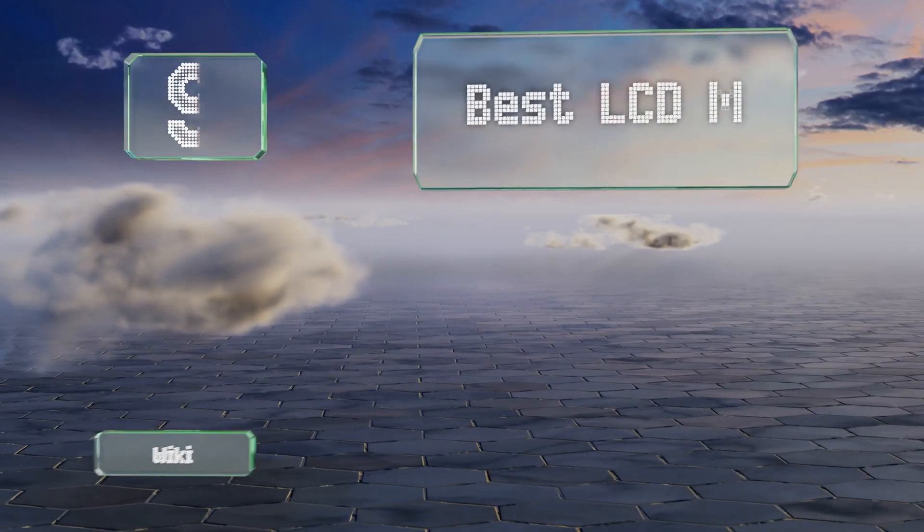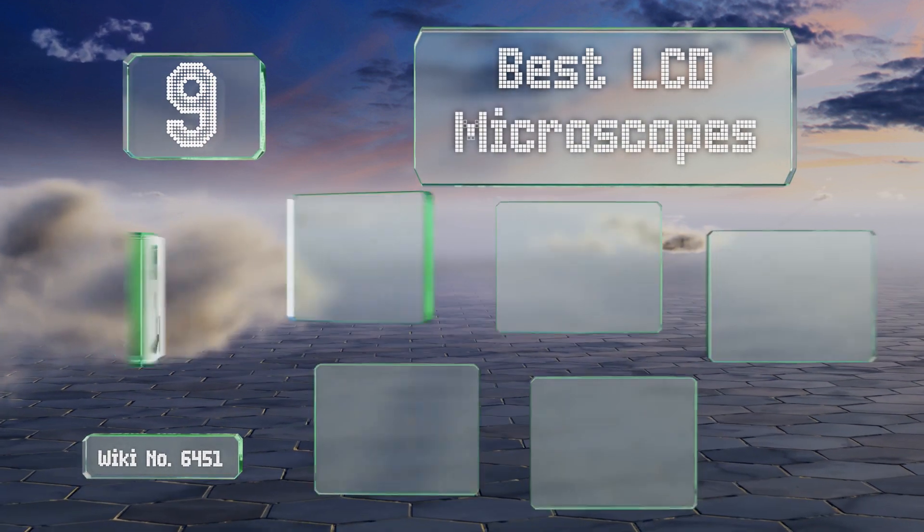EasyVid presents the nine best LCD microscopes. Let's get started with the list.